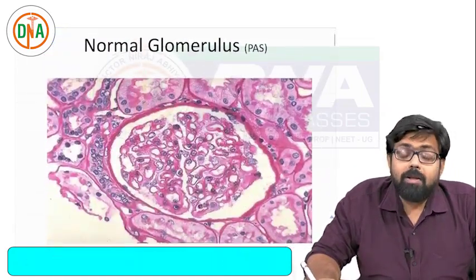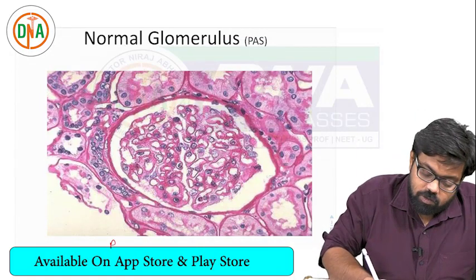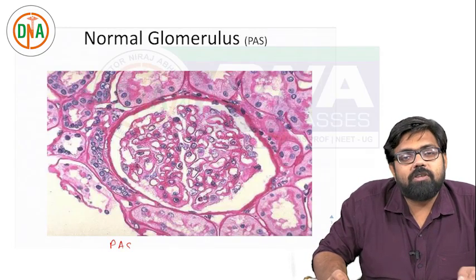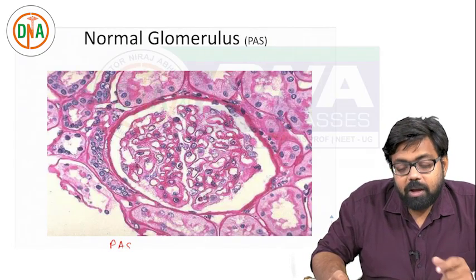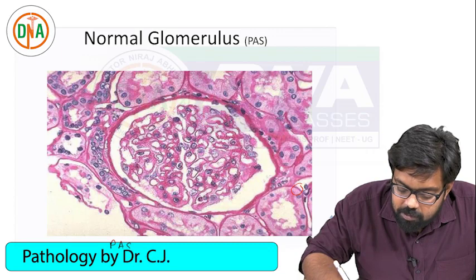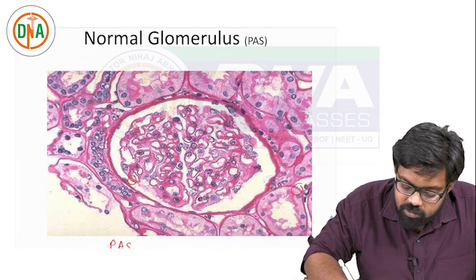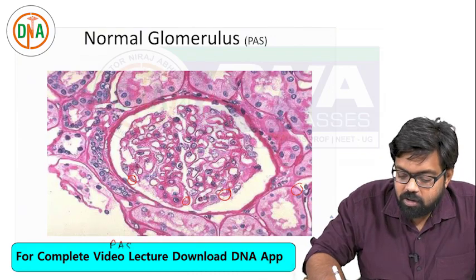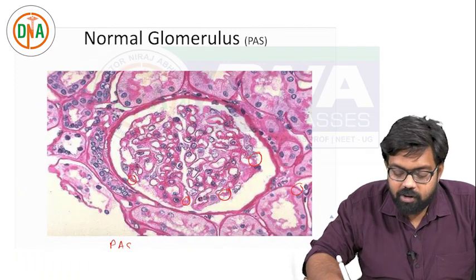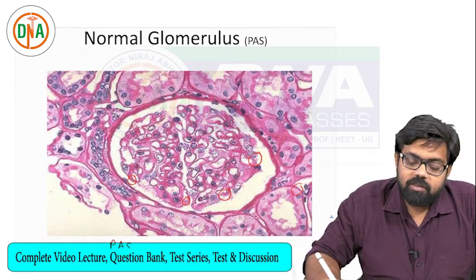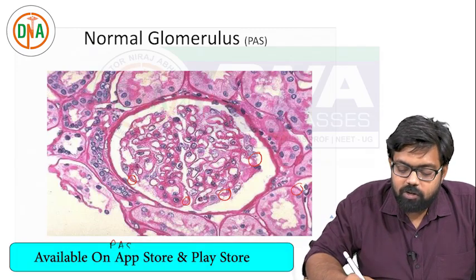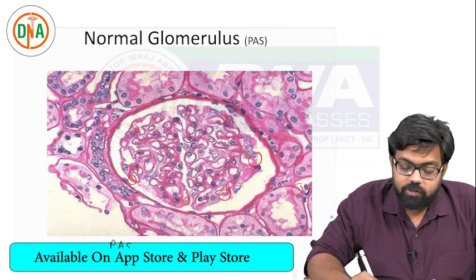Next is the normal glomerulus with a special stain called PAS - periodic acid-Schiff. With PAS stain you can compare the thickness of the glomerular basement membrane with the tubular basement membrane. This is the tubular basement membrane and this is the glomerular basement membrane. The glomerulus still looks normal with no pathology identified. So this is the normal PAS of a glomerulus.